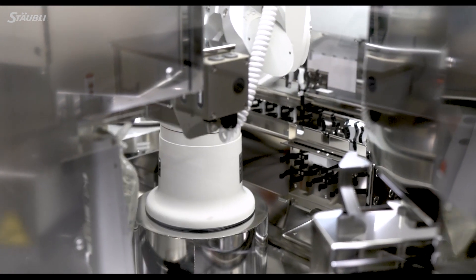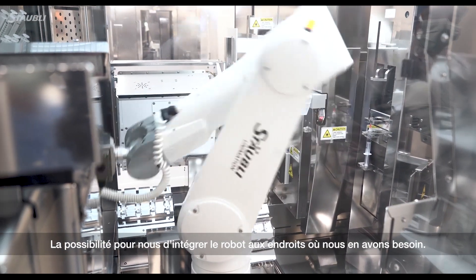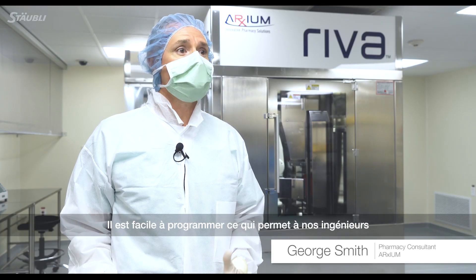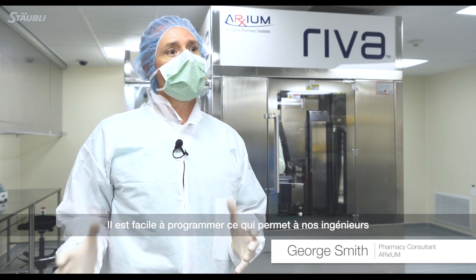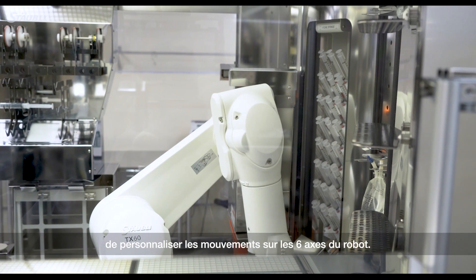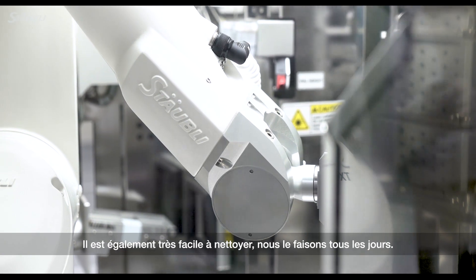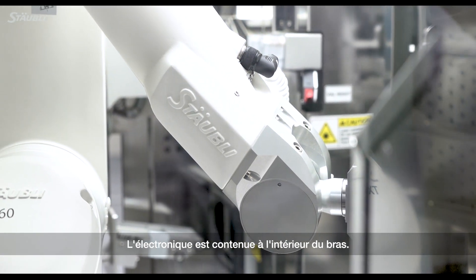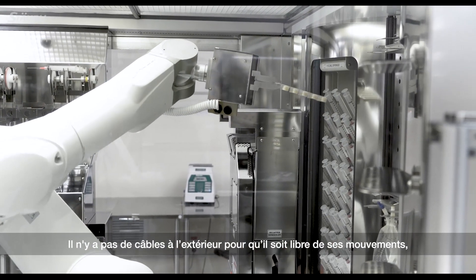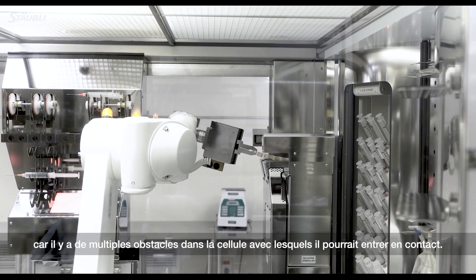One of the great things about the Stäubli arm is its precision, the ability for us to train it in the different points that we need it to do, its ease of training, its purposeful movements, and the ability for our engineers to customize some of the movements using the six axes that it provides. It's very easily cleaned — it is wiped down every day. The electronics are all contained on the inside; there are no cords hanging out to get caught in its movements, because it's making multiple movements throughout the cell with protrusions that could easily be caught on something.